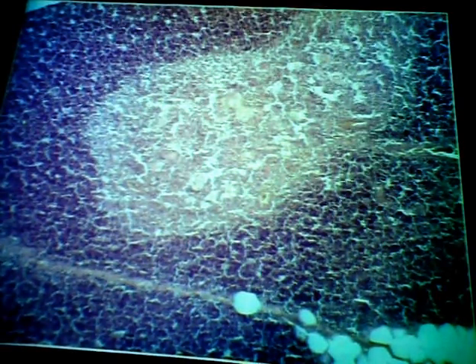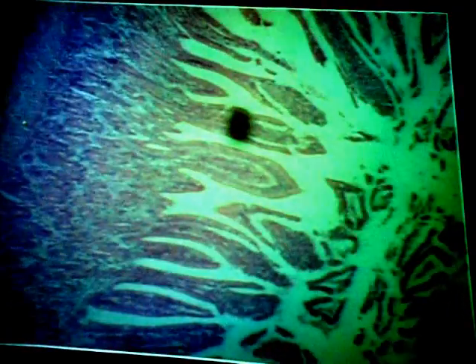Any questions on the thymus? All right. Something else we looked at yesterday. We're looking here at a section through the small intestine. And right now you don't need to worry about all the structures in the small intestine. That's coming later when we get to the digestive system. Then I'll be expecting you to pick out the various regions of the intestine, but not now.